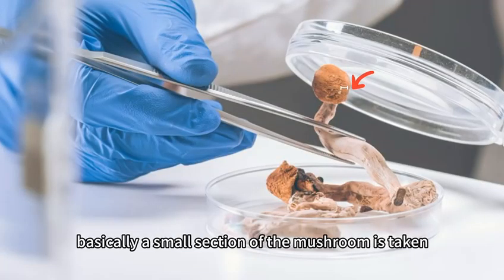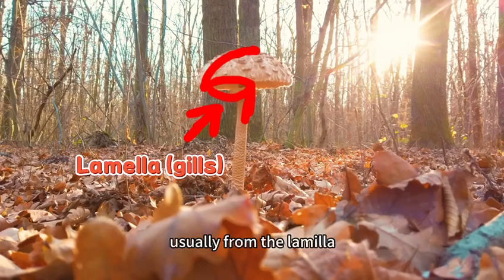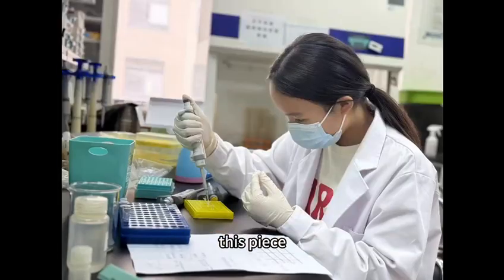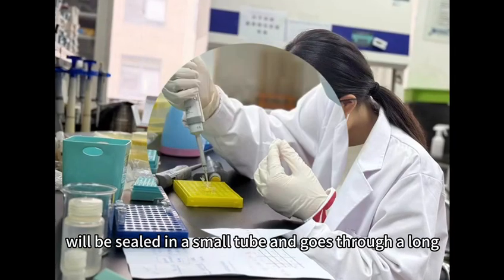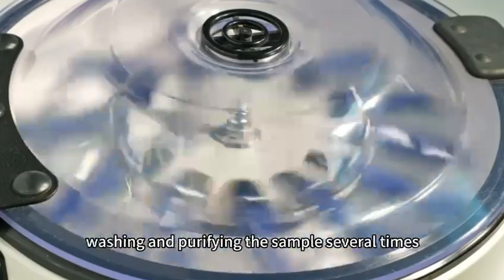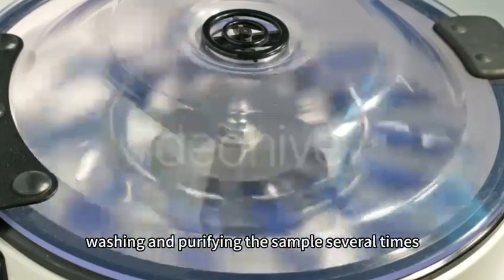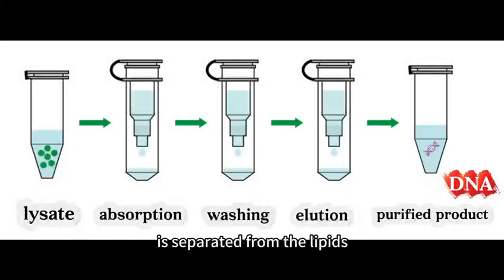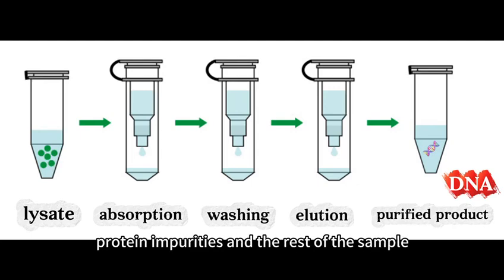Basically, a small section of the mushroom is taken, usually from the lamella or the gills on the underside of the mushroom cap. This piece will be sealed in a small tube and goes through a long, complex chemical process that involves breaking, washing, and purifying the sample several times until the extracted substance containing DNA is separated from the lipids, protein, impurities, and the rest of the sample.